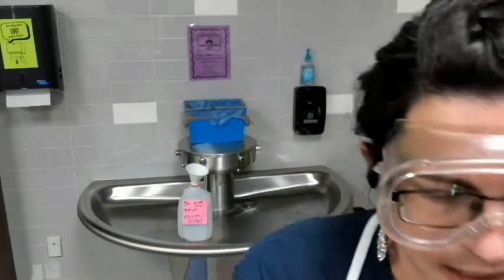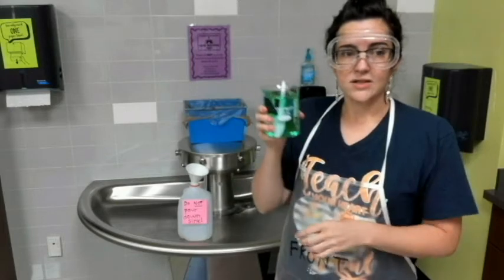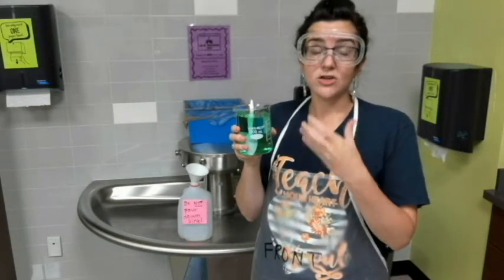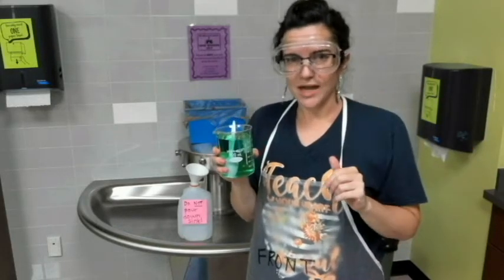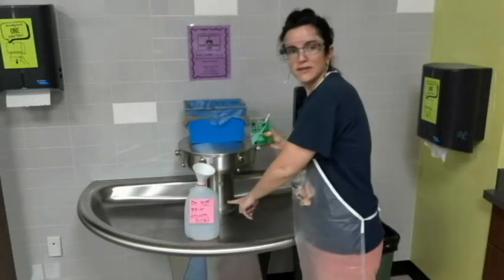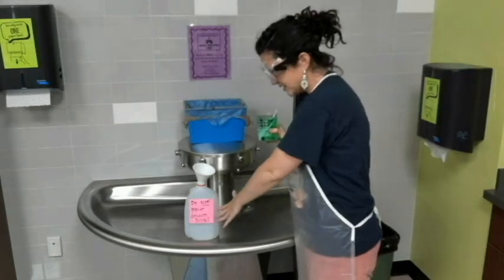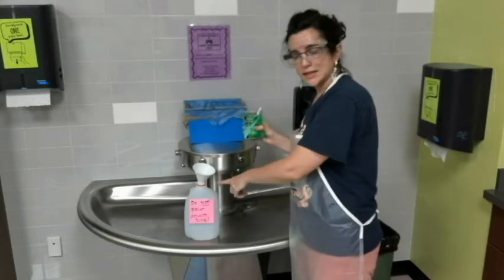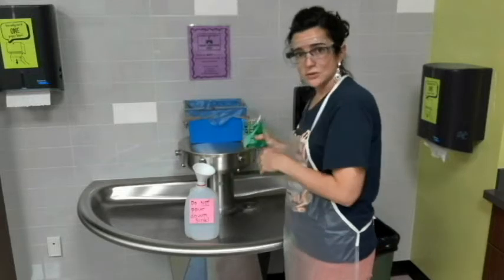But let's say we have some sort of liquid that is not safe. Maybe it's a chemical or something, again, that might cause harm to the pipes if it gets poured down the sink. We don't want that. So we might have a little container like this. Right here we have an emptied out clean milk jug. It has a sign on it that says do not pour down the sink, and it's okay to pour this liquid in here using a funnel for safety so that there's no spillage.